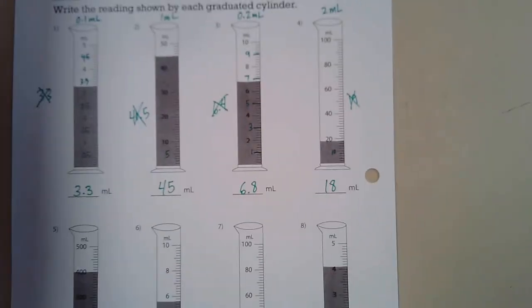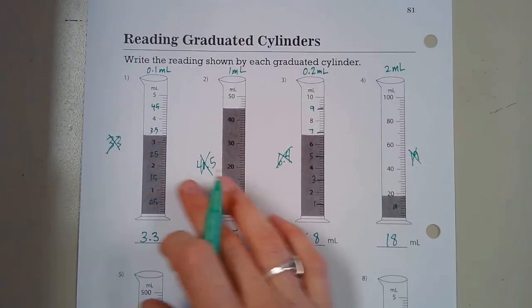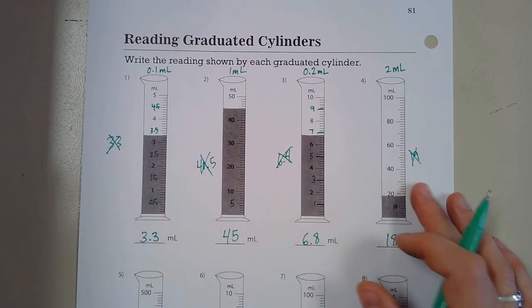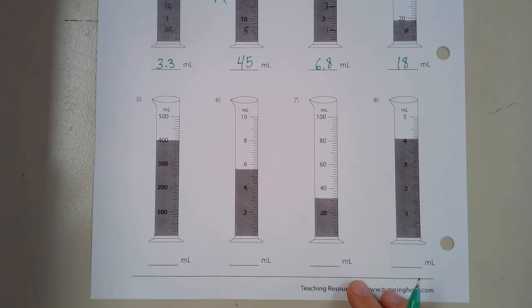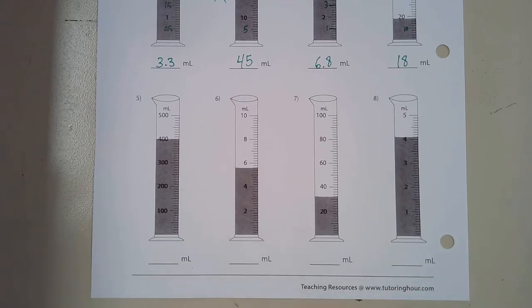So I would encourage you students to use this top part, see if what I've explained to you helps you. Try to do the bottom, and then if you want me to check your answers, send me an email or message and I can do that for you.